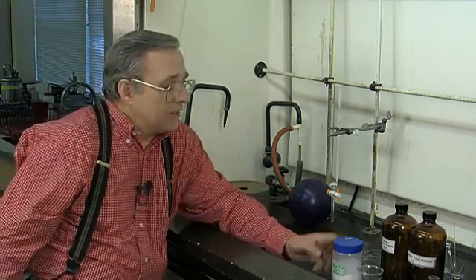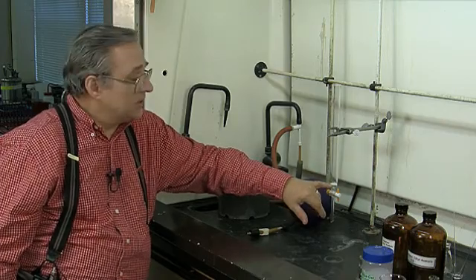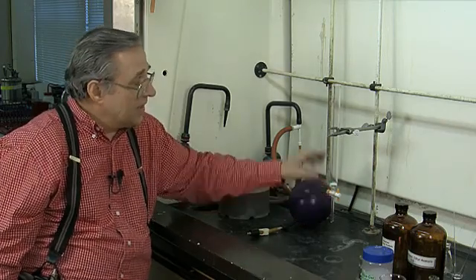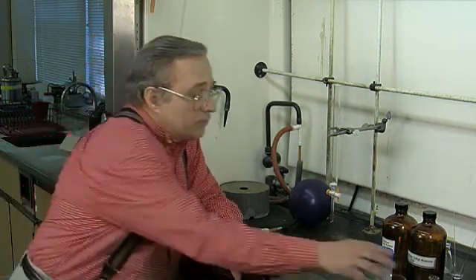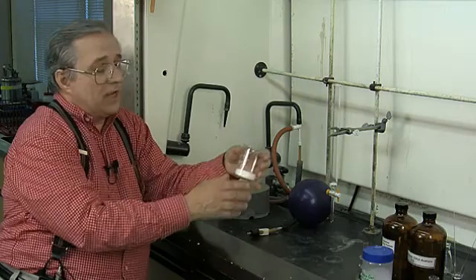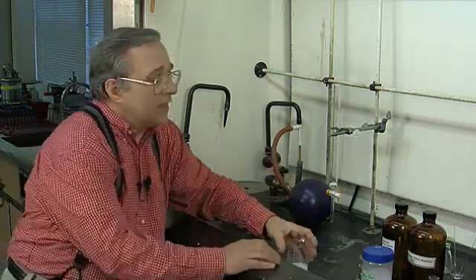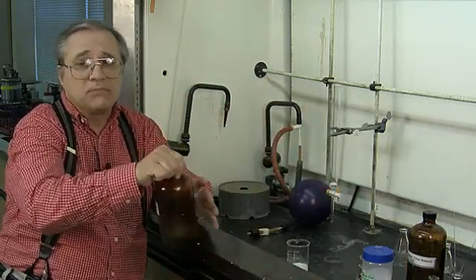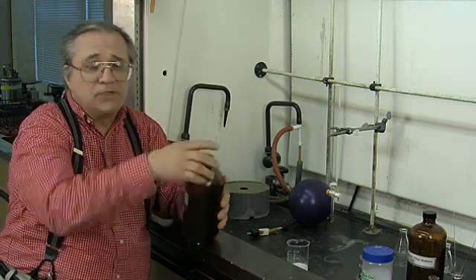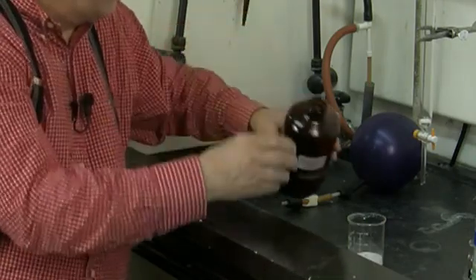Here I have a typical column — it looks like a very fat burette. It has a sintered glass disc inside, a stopcock, and it's about 15 inches long. We're going to fill it with silica gel. I've weighed out approximately 15 grams of silica gel, and from my TLC experiments I found that I could get movement of the spots using 8-to-2 hexane/ethyl acetate, and that's what I'm going to use here.